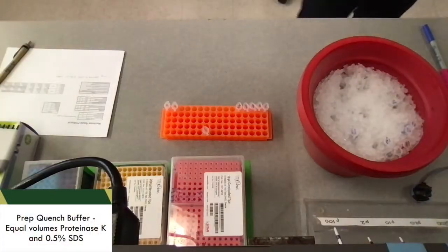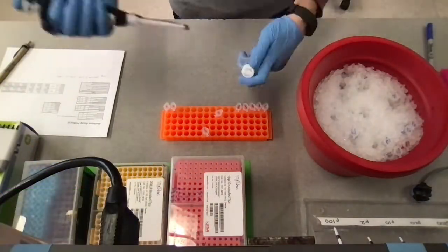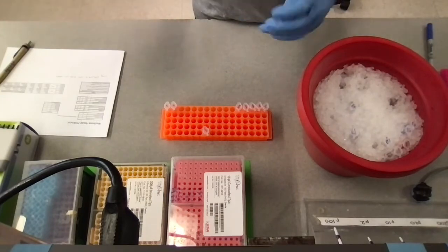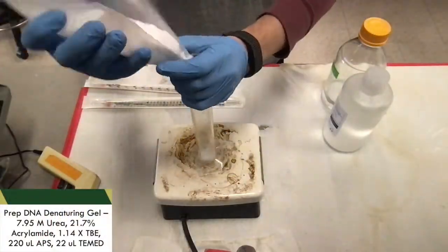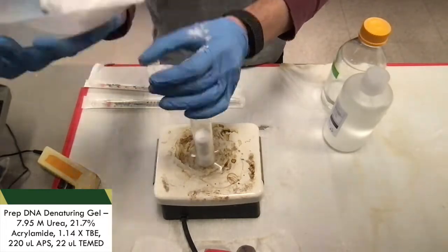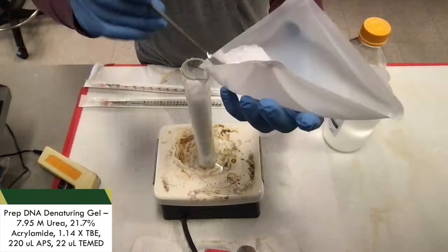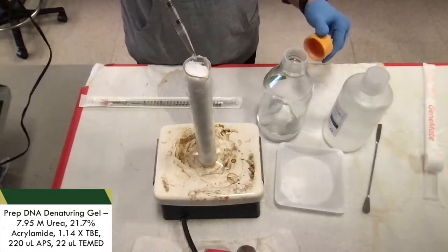While that's running, we're going to go ahead and make our quench buffer. The quench buffer is made up of 2 different things: we have 0.5% SDS and we have proteinase K. In addition, we're going to go ahead and make the DNA denaturing gel. This consists of 7.95 molar urea, 21.7% acrylamide, and 1.14x TBE.